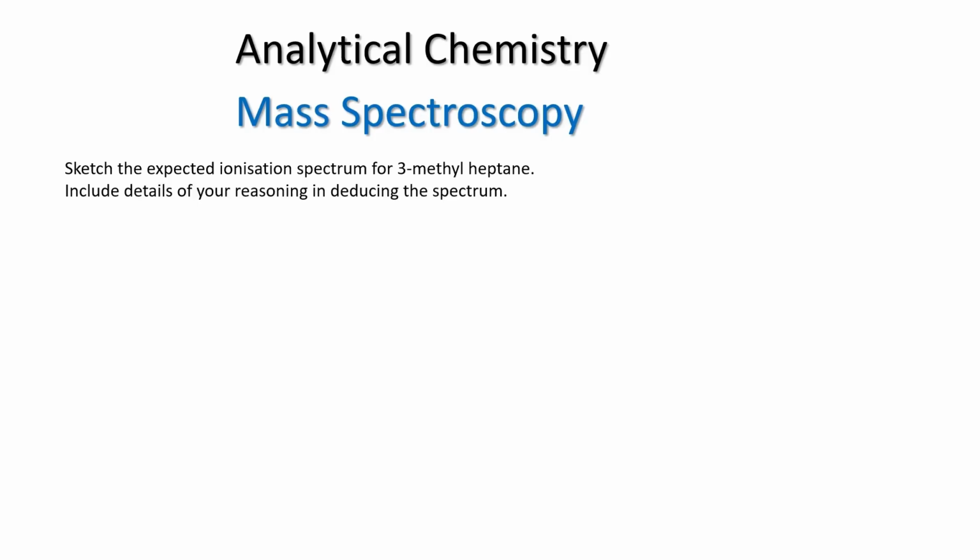And previously I have explained how to analyze mass spectrum and deduce the molecular structure of analytes. So today I'm going to be discussing how to sketch possible mass spectrum of analytes.